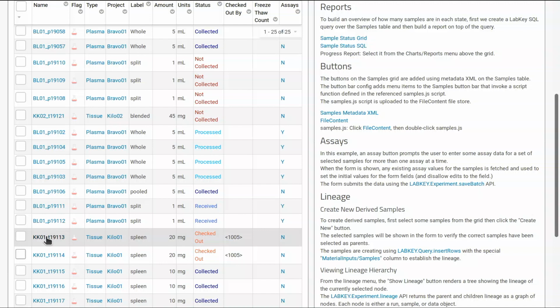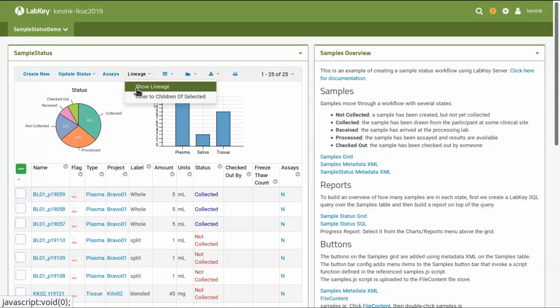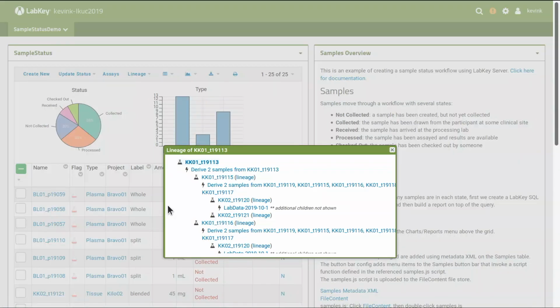So right now the Lineage API only works with a single node. I can only do one at a time here within this chart, but that's just because that was the initial use case. There's nothing to stop us from looking at two samples. Are you saying you want to look at the intersection of those two lineages, or just return all of them?